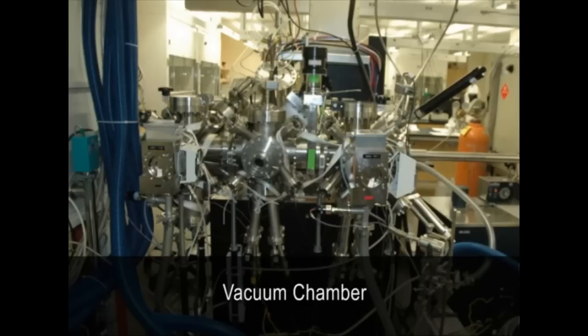The fabrication is completed within a vacuum chamber. It consists of a series of stainless steel chambers and organic sources that can be sealed and then evacuated. The organic solar cell is held by an internal arm and then maneuvered through different phases of fabrication.